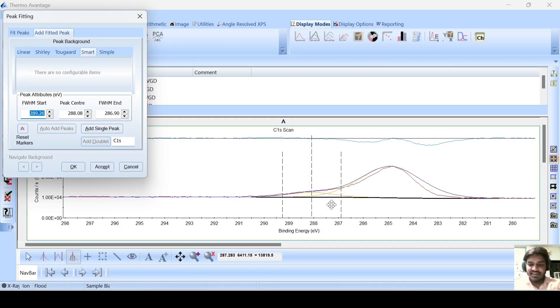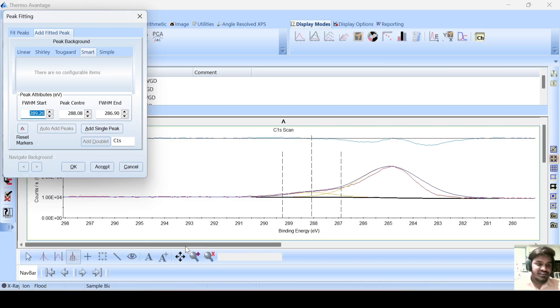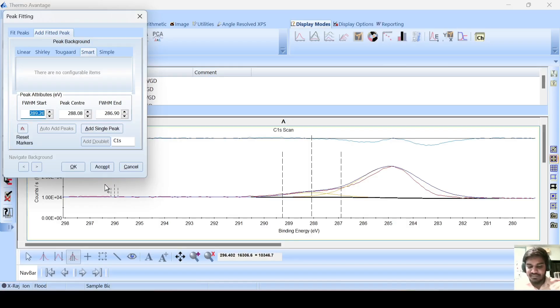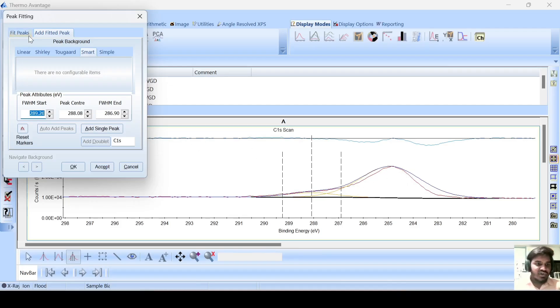That means your carbon has two oxidation states, or it is connected to two different elements — maybe carbon-oxygen and this one is for carbon-carbon. Again, go to fit fix, click this level. It automatically gets fit.